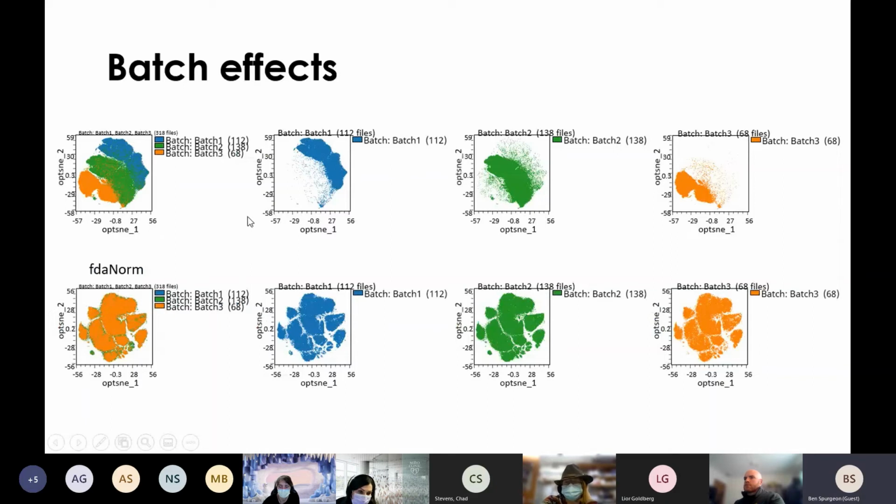Maybe you guys know about other tools and other approaches that might be effective, but it seems to give us reasonable results. We ran a t-SNE plot on the different batches, and not surprisingly, each batch mapped to a different region of 2-dimensional space when the raw non-normalized data was used.